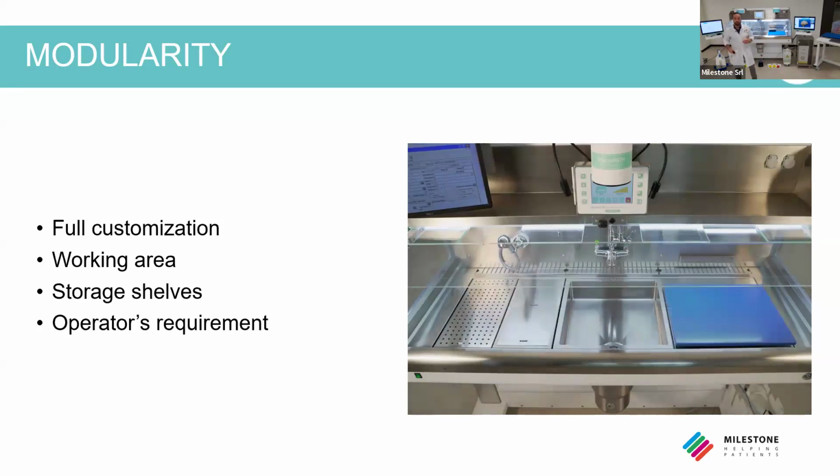And then let's see, we do have the possibility to follow the routine of the laboratory. This disposition is the same that I have in the rear part behind me. So how does it work? We have a bucket which is positioned on the tray at the arrival.